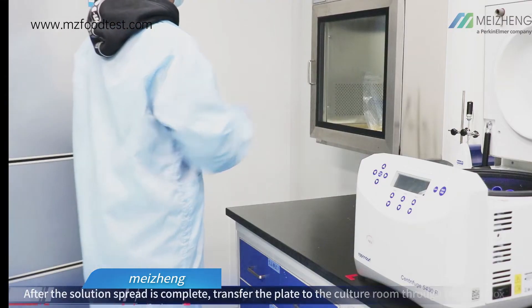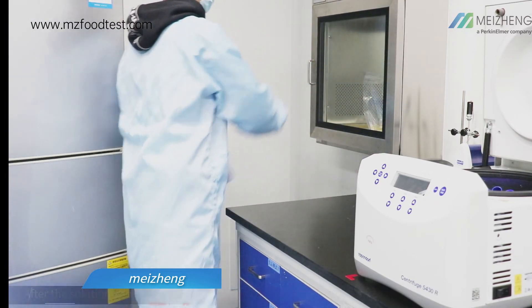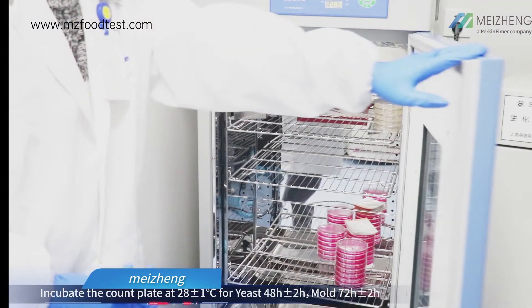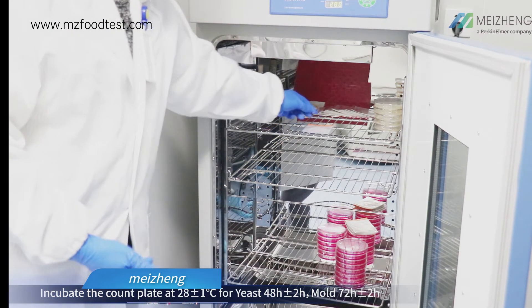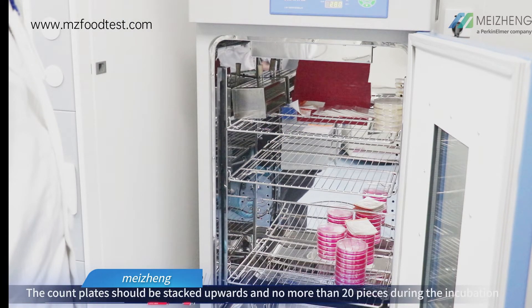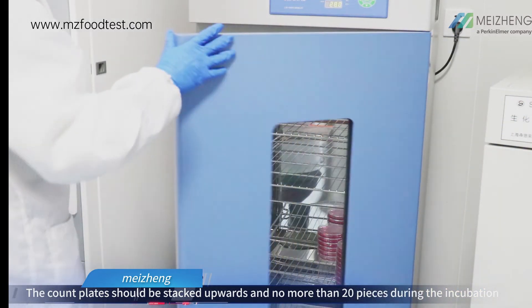After the solution spread is complete, transfer the plate to the culture room through the pass box. Incubate the count plate at 28°C with a tolerance of ±1°C. Yeast: 48 hours with ±2 hours tolerance. Mold: 72 hours with ±2 hours tolerance. Count plates should be stacked upwards and no more than 20 pieces during incubation.